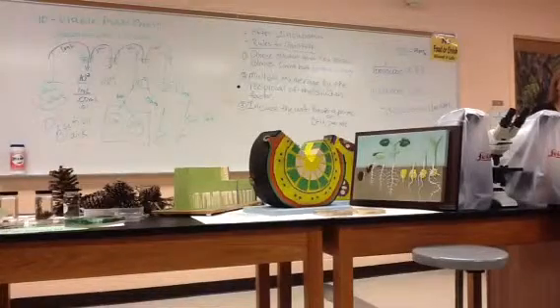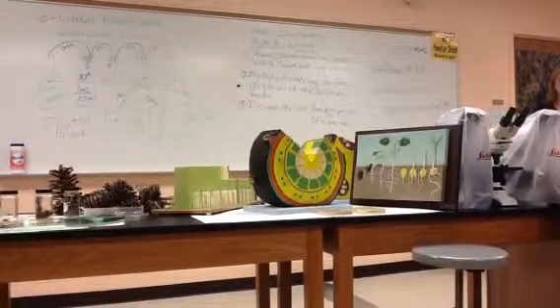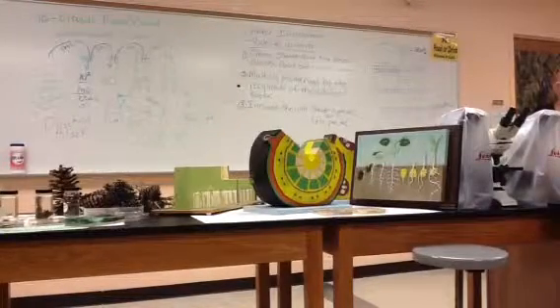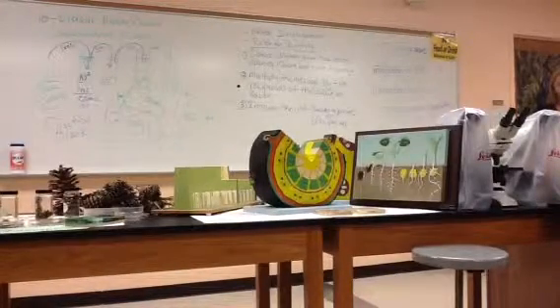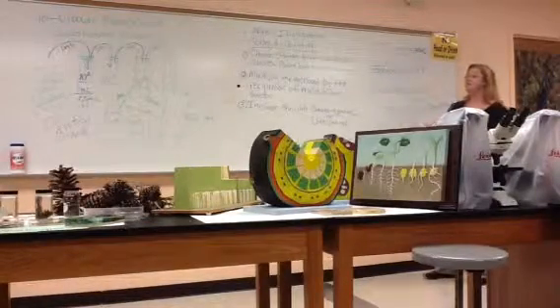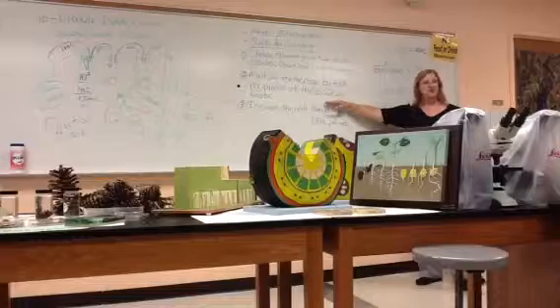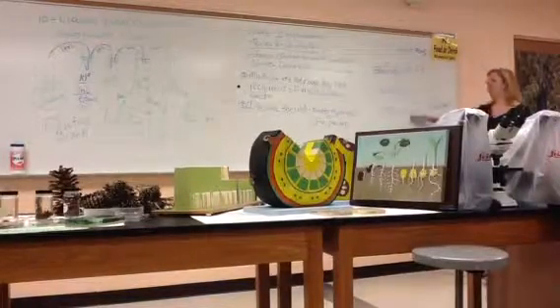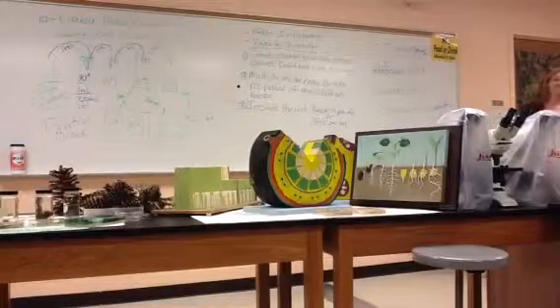Any other questions? Want to do it one more time, or are you good? Good? Just add whatever zeros to the end. Yep, whatever one you count, you add that many zeros to the end. But you do need to be able to tell me what the dilution factor is, what the reciprocal is. Be able to do it, but literally that's all the math you're doing.